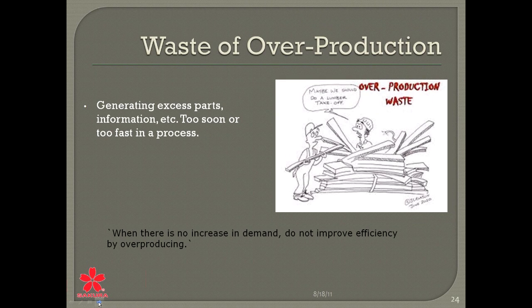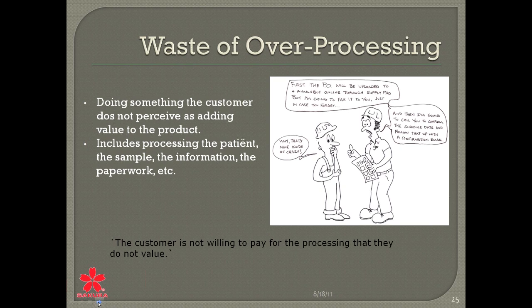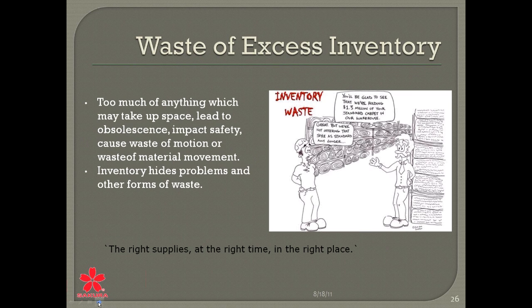And there's the waste of overproduction. When you just need one block, just make one block and don't make two blocks. As one pathologist of mine always said, it's just to cover my ass, and I will make another block. There's also the waste of overprocessing. That's when you do something more than your customer perceives, and it's not adding value to your product. And you can put your, we call it the magazine, full with stuff, but if you don't use it, it takes room, and room is money. So that's why it's not good to have it over there.